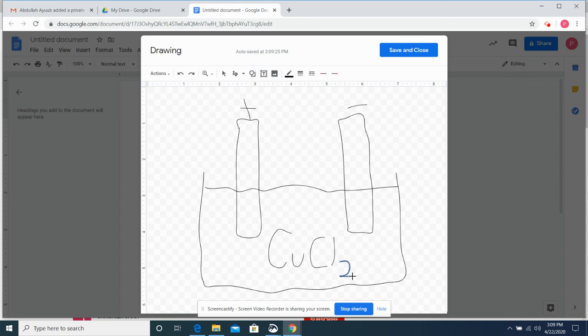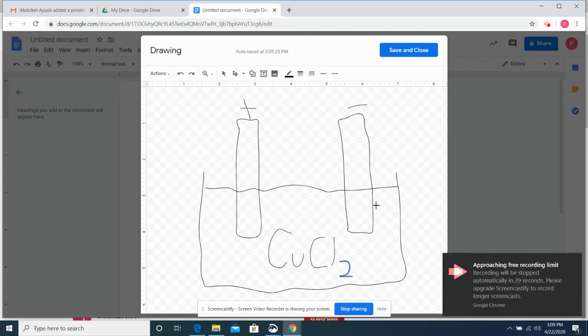And there's going to be some evidence from the electrodes right here and right here as to what is actually happening when copper chloride dissolves in the liquid, all right? And that's what you're trying to get to. What really truly happens when copper chloride dissolves in the liquid, all right? So that is your object, and you're going to have evidence on the electrodes that's going to tell you what's happening.